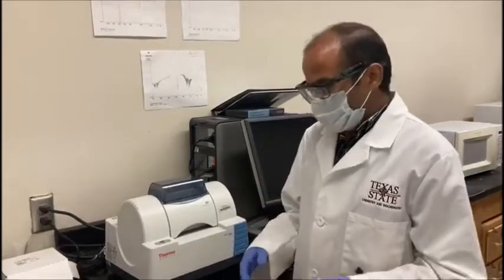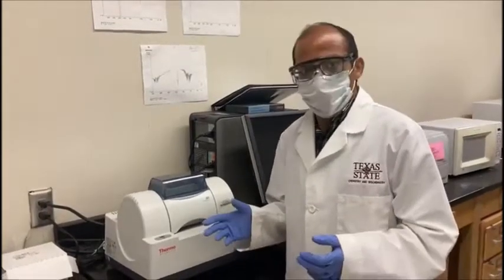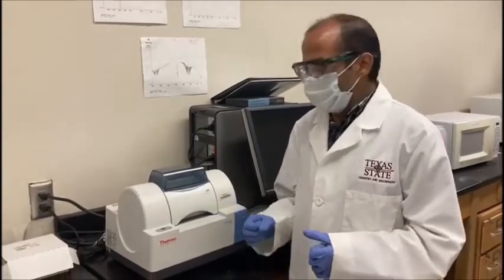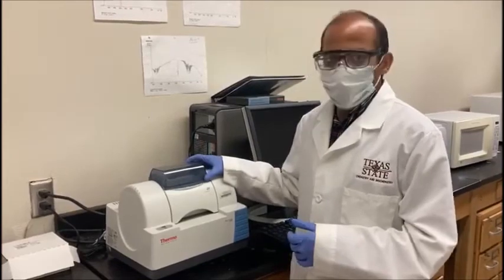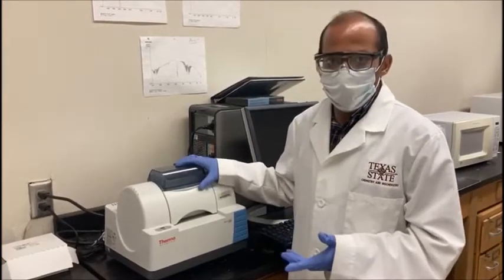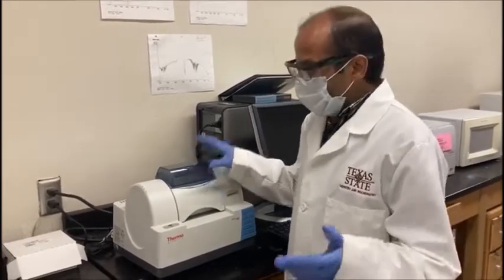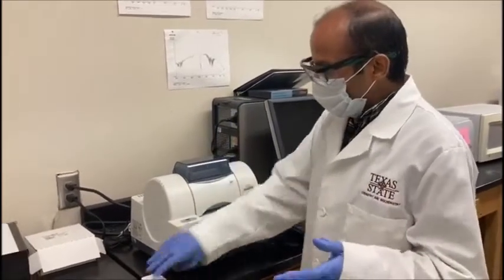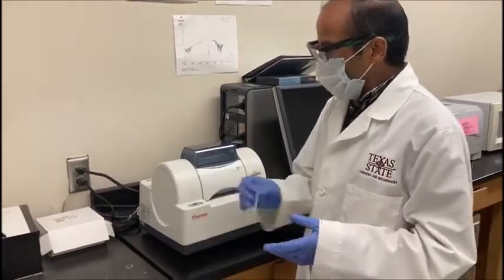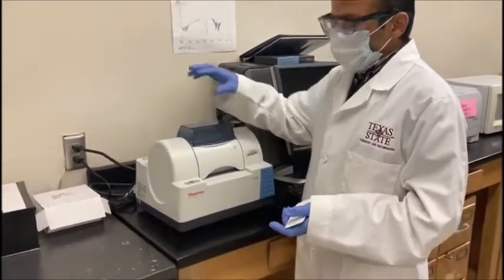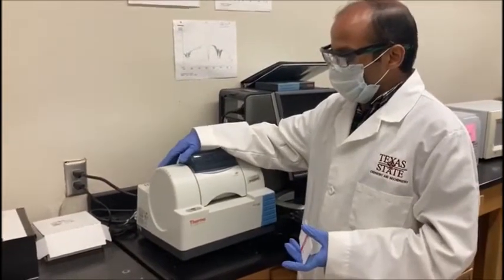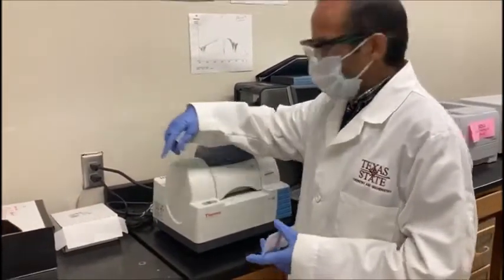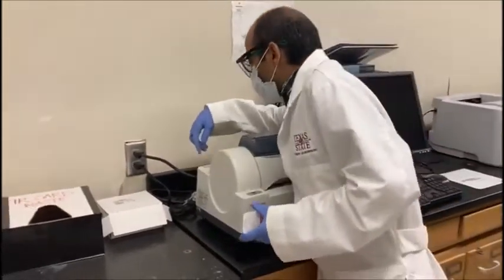Hello, welcome. In this video we will show you how to operate this IR machine. Before anything, we have to warm up the machine. Here is the power button.